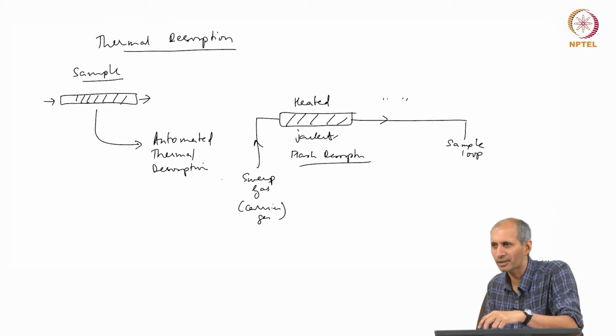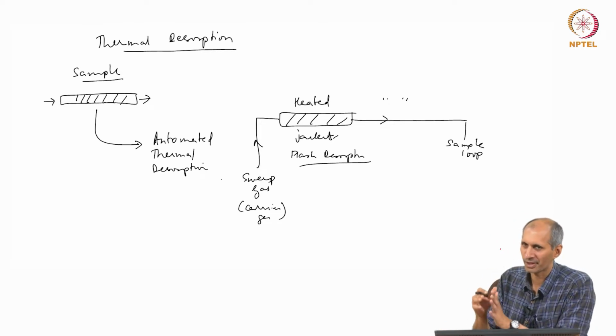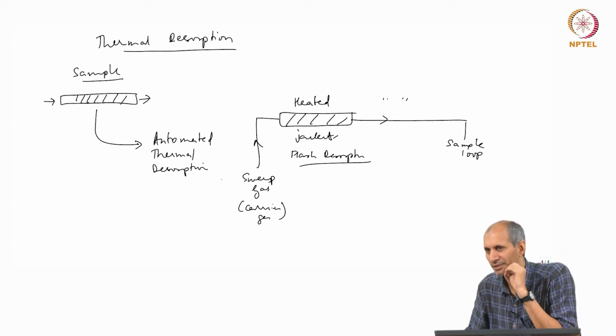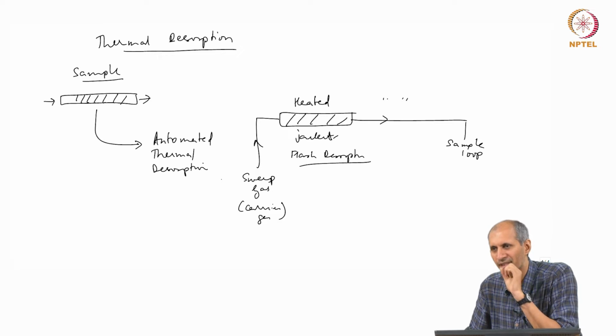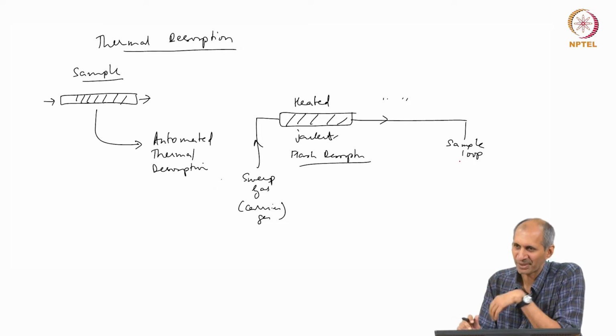This is important, because what you measure in the GC depends on what you are injecting, and what you are desorbing has to be in a finite, well defined volume, so that you know what the sample volume is. Otherwise you do not know what you are injecting, what is coming out, and all this is a big mess. So, this is all carefully calibrated and done. The sample loop will allow you to keep this in place. Let us not get into sample looping, you can go and read about it.